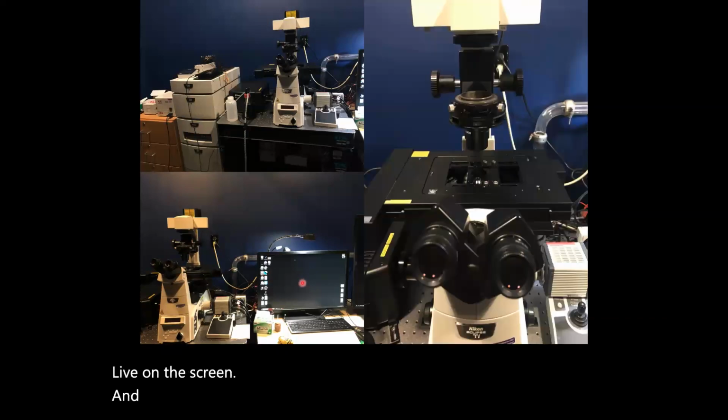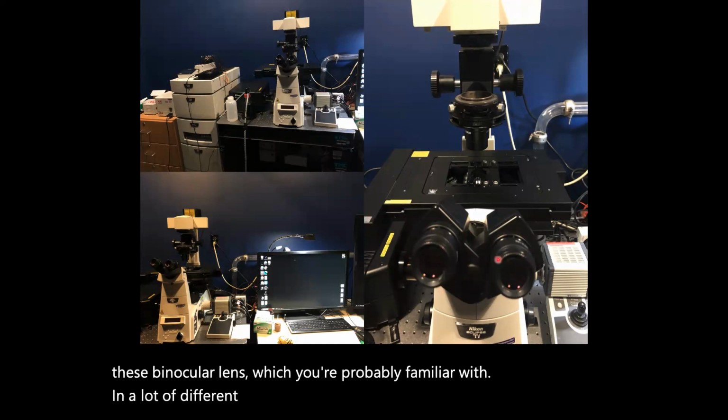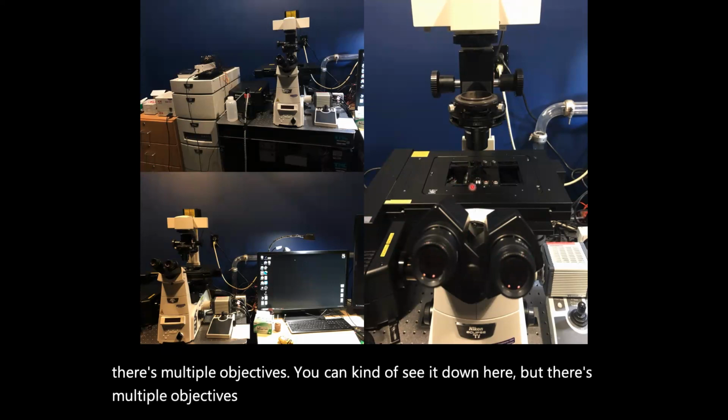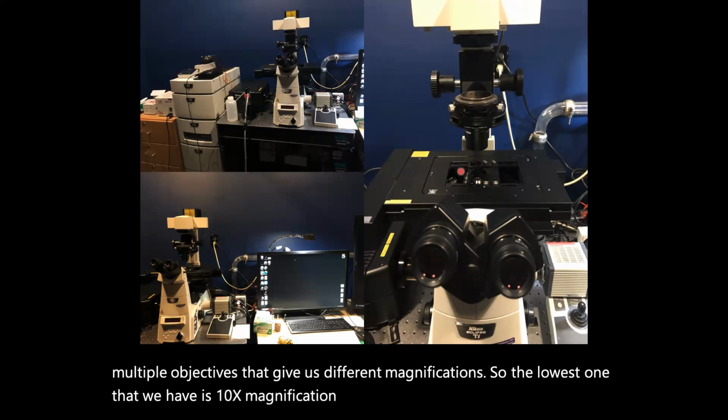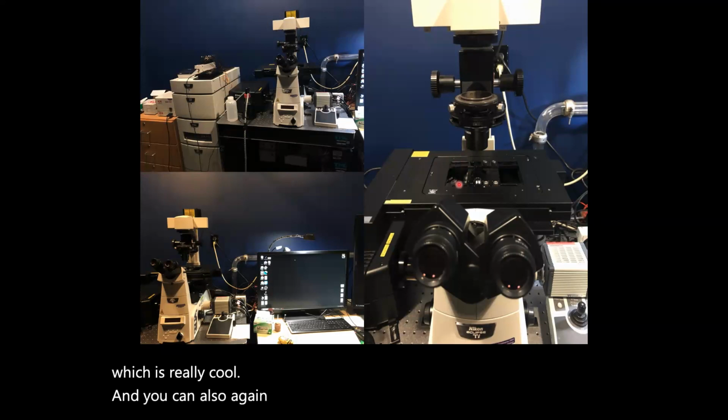And this is a close-up of the different lens and the objective. So you have these binocular lens, which you're probably familiar with in a lot of different microscopes. But what's really unique here is that there's multiple objectives. You can kind of see it down here, but there's multiple objectives that give us different magnification. So the lowest one that we have is 10x magnification, but we can go up to 100x actually, which is really cool. And you can also, again, control the pinhole and everything from this station.